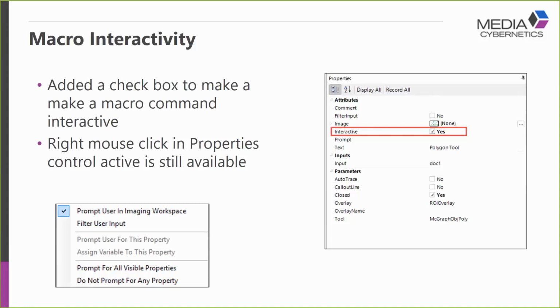Again, just a brief comment. The great thing about macros is if there's some type of interaction where people are going through the same set of operations over and over again, it's really a great way to simplify processes and make a better user experience, and people can get in, do the work, and get out. So again, it's a great enhancement from a usability standpoint. So let me just quickly show how this works.